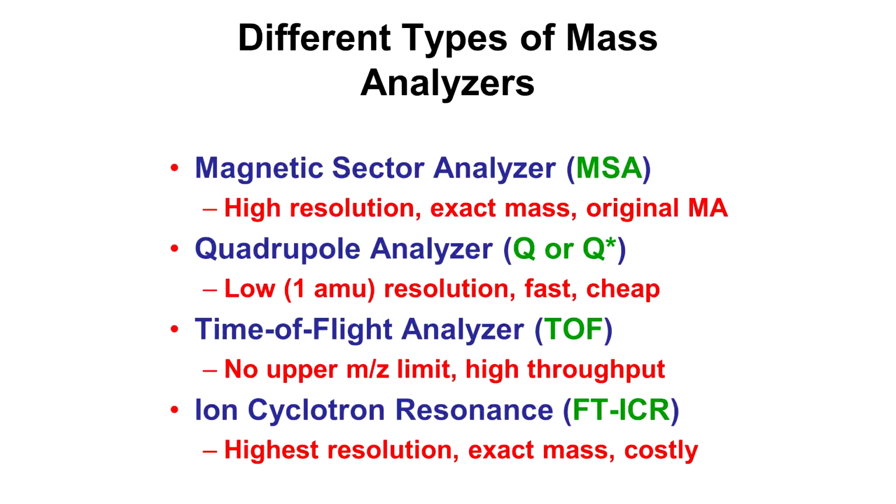You can put several quadrupoles together, and you get a triple quad. And this is the most popular mass spectrometer in the world, actually, and used widely in drugs and in newborn screening. Time of flight historically was the most accurate, but then was replaced by things like Orbitraps and FTICRs. These are expensive instruments, so generally the higher the resolution, the more money.